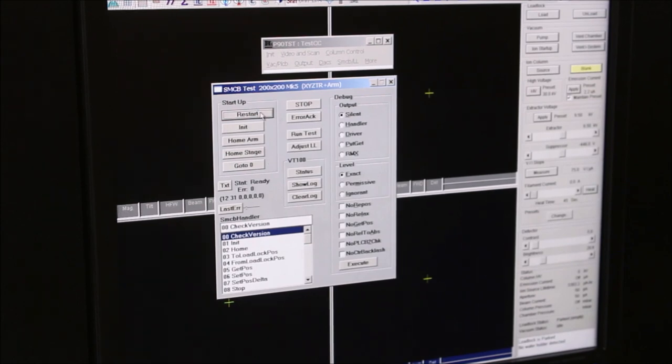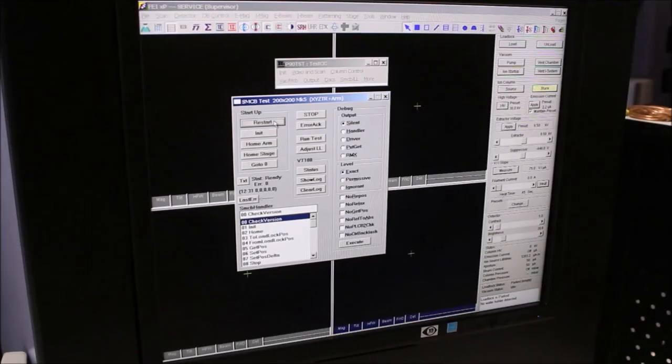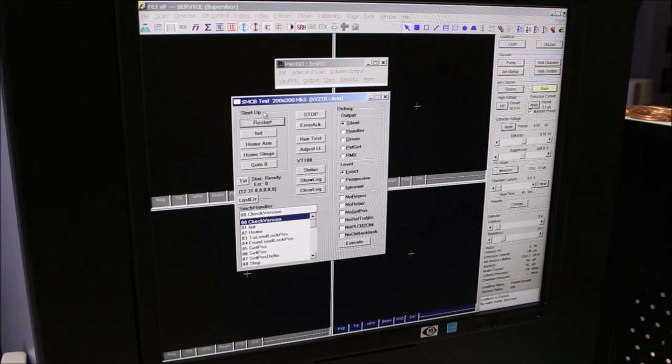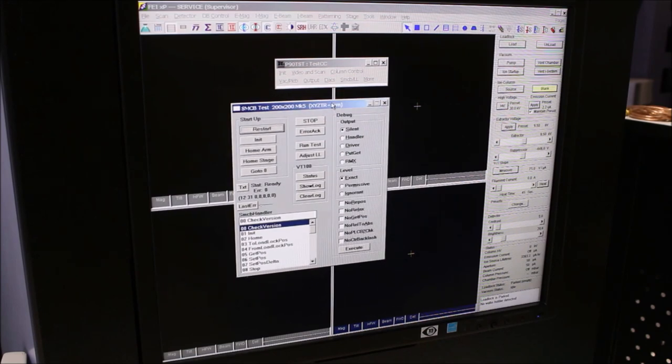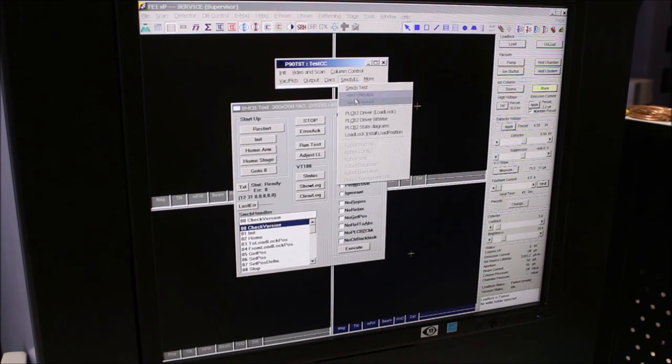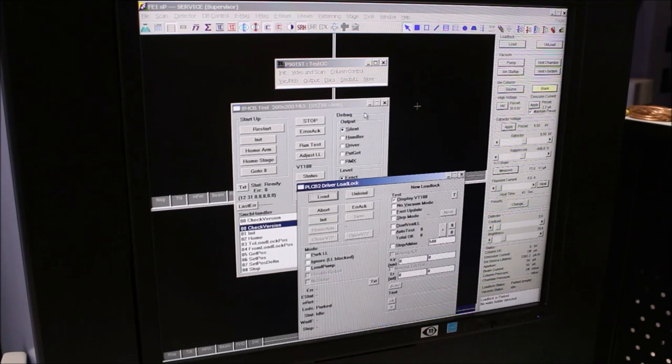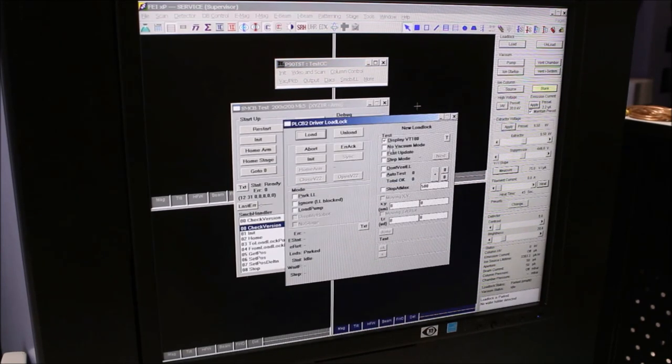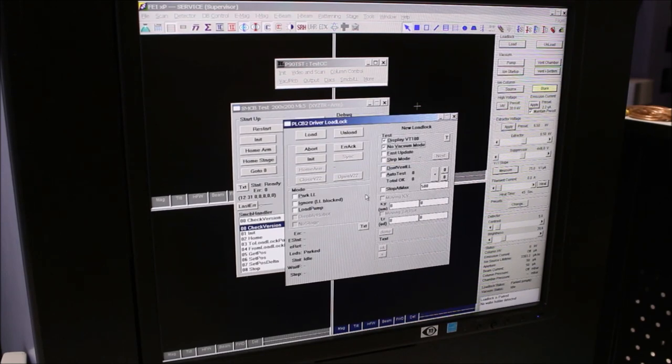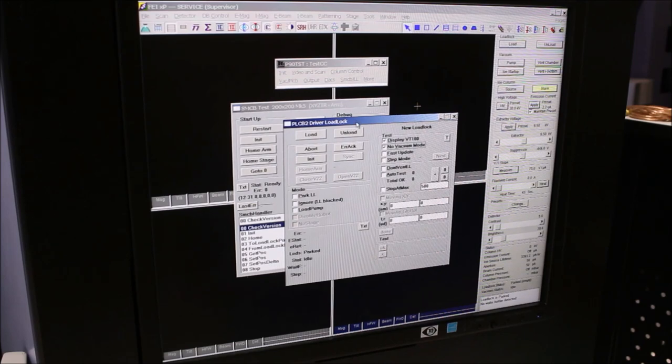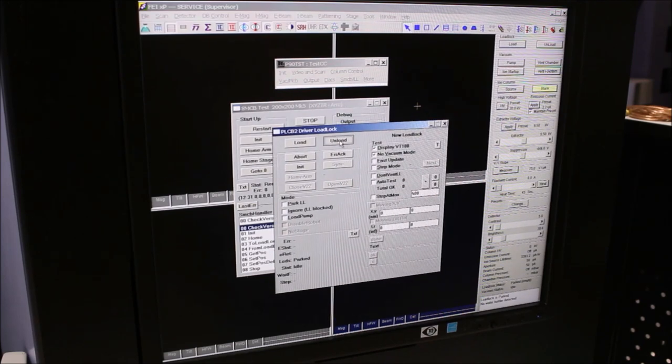Looks like everything's good so far. The next thing we want to do is make sure that the load lock and stage are aligned properly. Since I didn't really make any big changes to the stage, I'm pretty confident that I don't really need to do the adjustment. I'm just going to do a no vacuum mode transfer before I pump it down. I think that will allow us to confirm that everything's okay. I'm going to start with an unload.